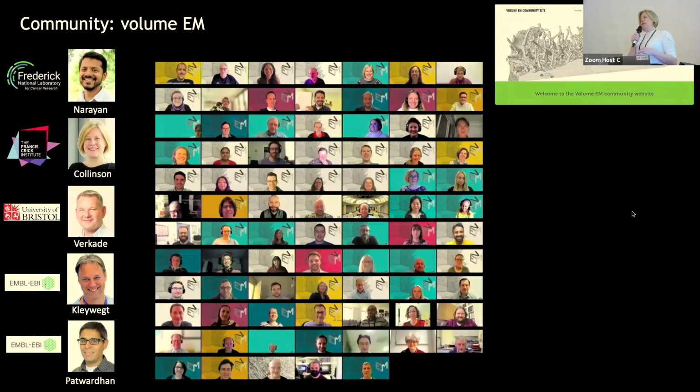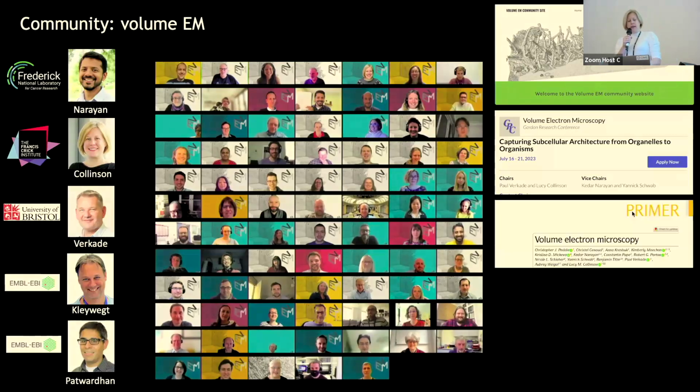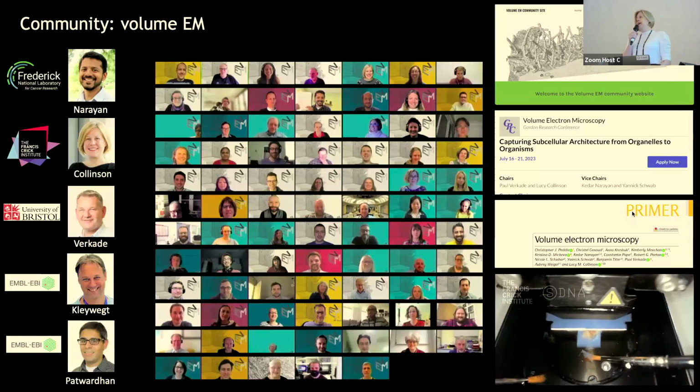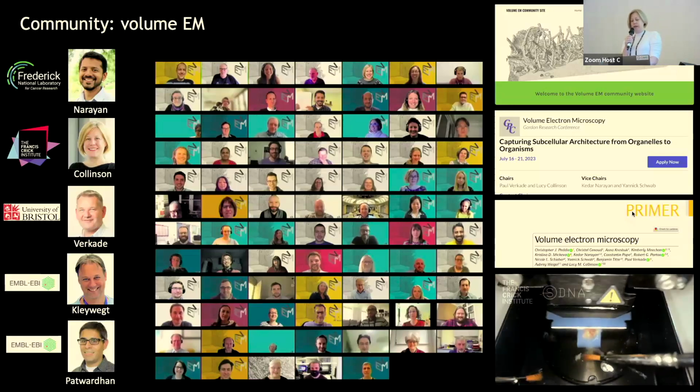The community have put out a lot of different resources. We have the Volume EM website, just search Volume EM and you'll get to it, and that brings together a lot of those resources. We had our first Gordon Research Conference last year in Ventura in California. I think some of you were there, which was amazing. And we also have a number of publications. So if you're new to the field, you could look up this primer on volume electron microscopy, which explains all of the fundamentals. And we have a number of training videos online to help you with the tips and tricks which you really need to get up and running.